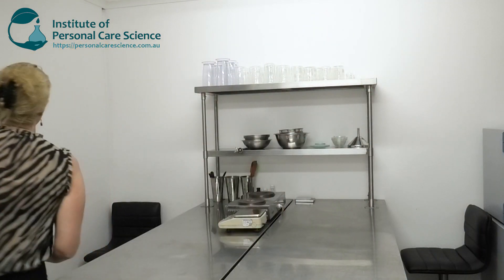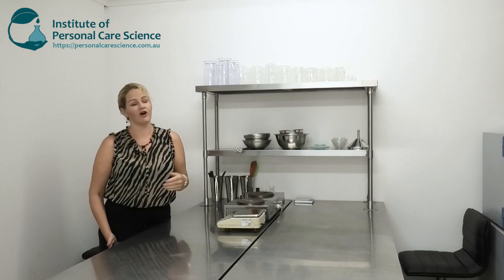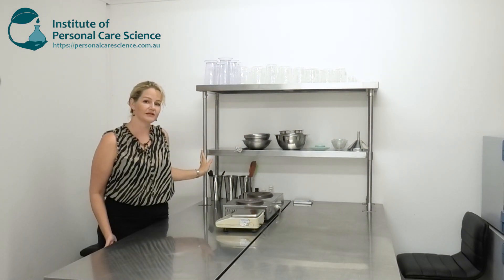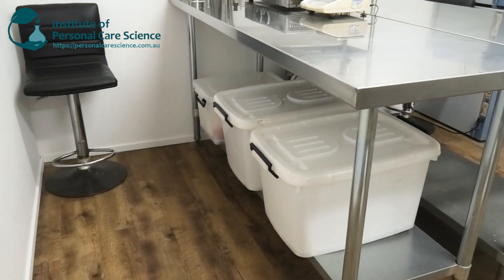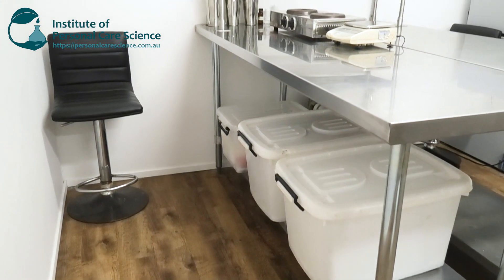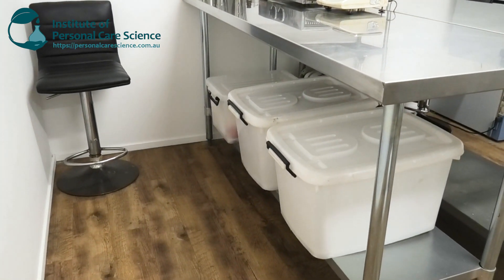Once equipment is dry, store it in a very clean environment. Here we have a dust-free, clean air environment in our lab so we can leave our equipment uncovered. If you're not going to be using equipment for some time, or aren't sure about the cleanliness of the air in your lab environment, then store equipment in airtight tubs.